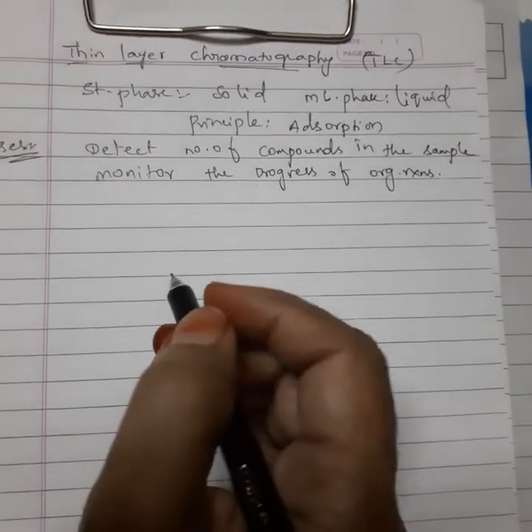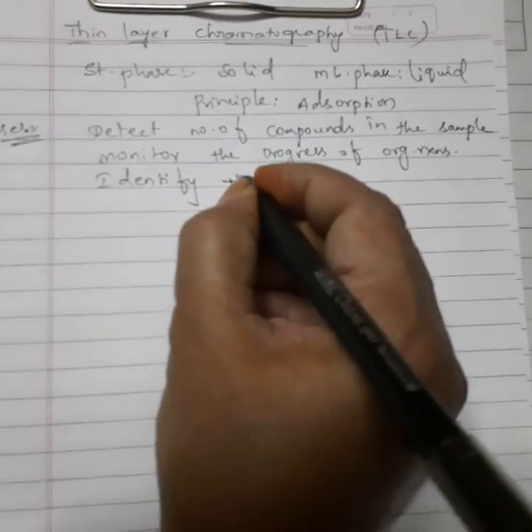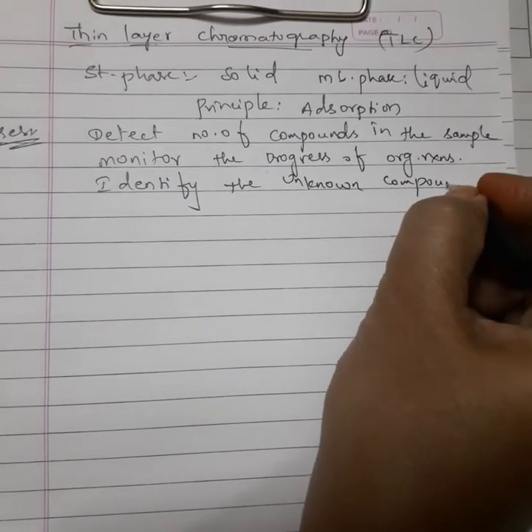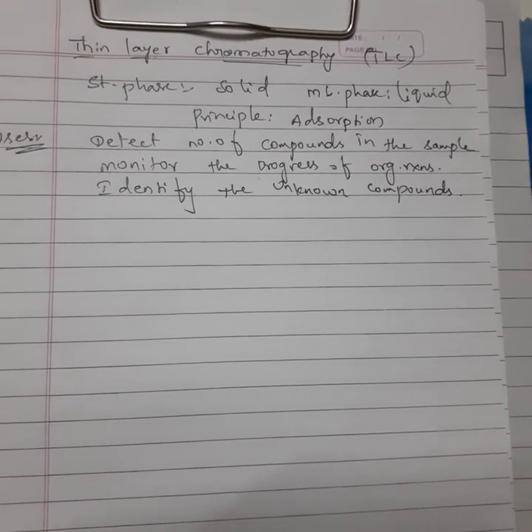And the next one, of course, is to identify unknown compounds. So there are many uses of this TLC.